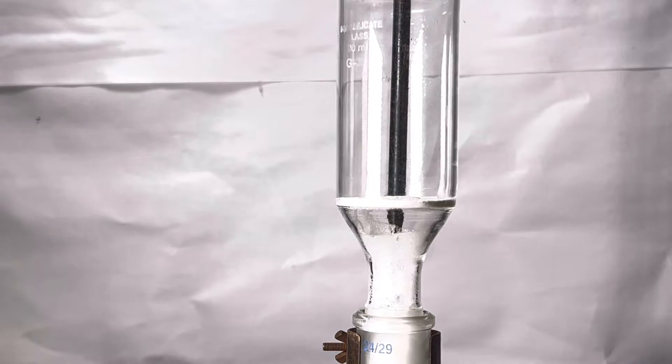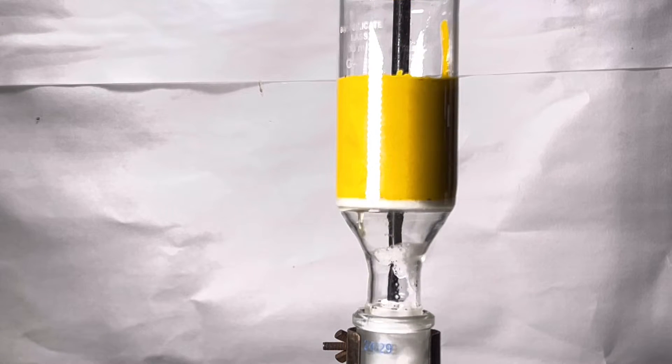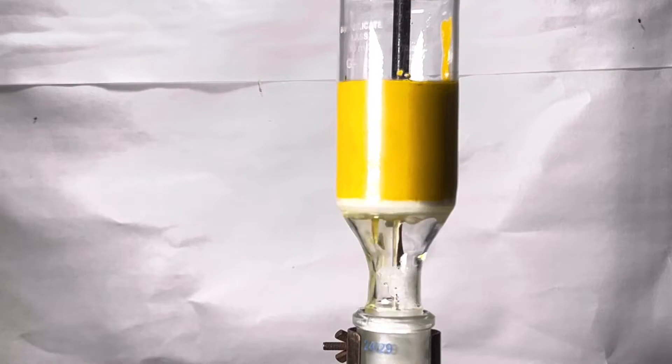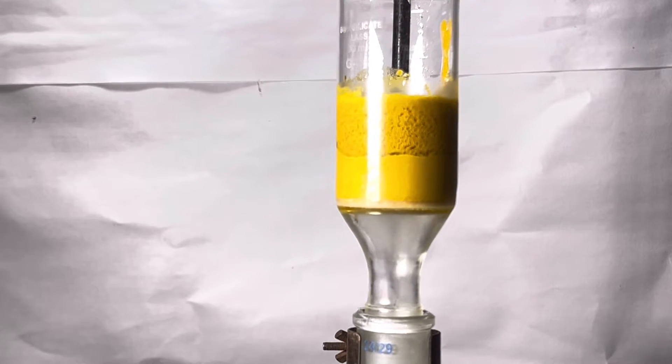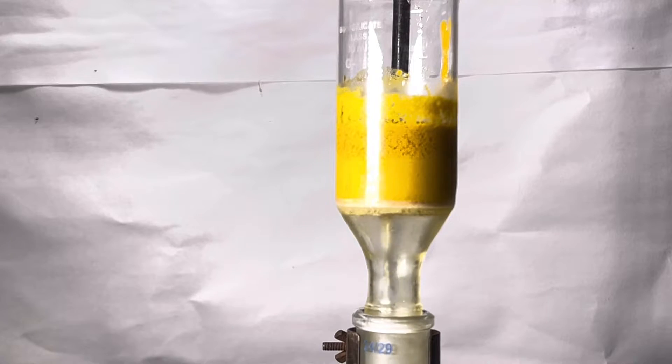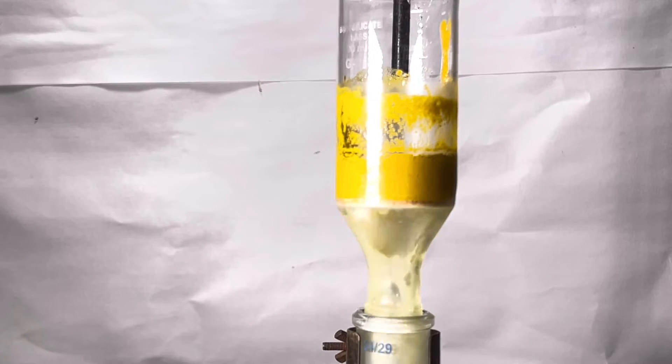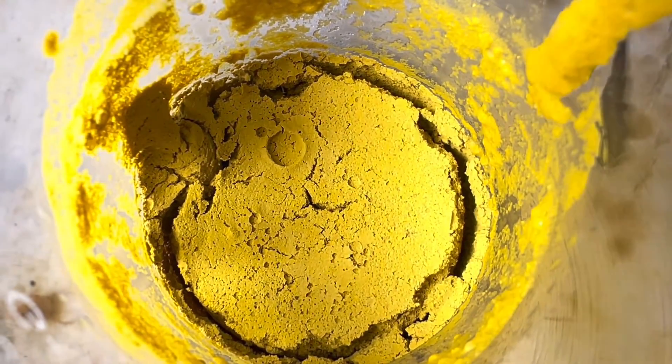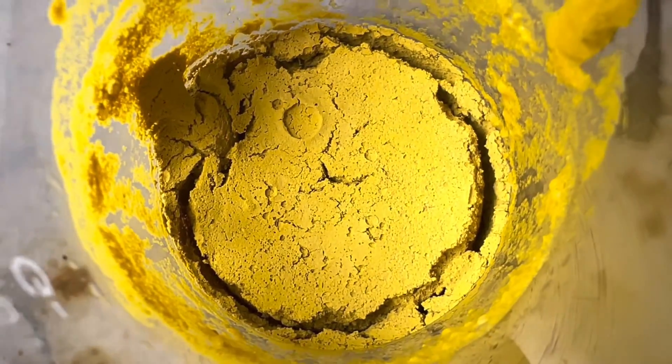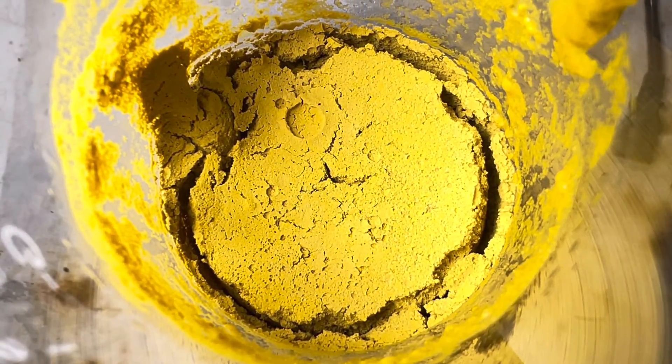Now vacuum filter the product using a Buchner funnel. The product was washed 3 to 4 times with cold water to remove all the water soluble impurities. The vacuum was turned on for few minutes to completely dry the product. Here is the crude product diazoaminobenzene. The weight of the dry crude product is 11.2 grams.